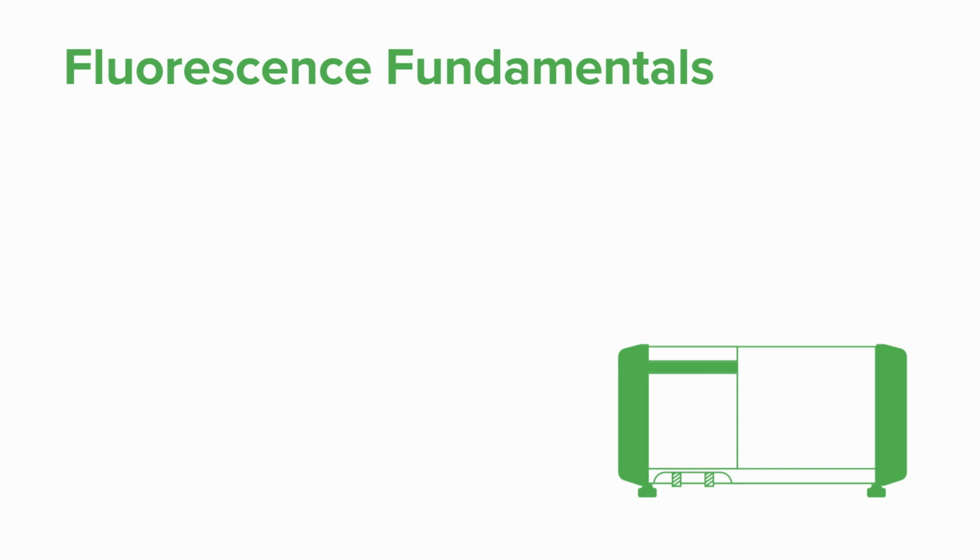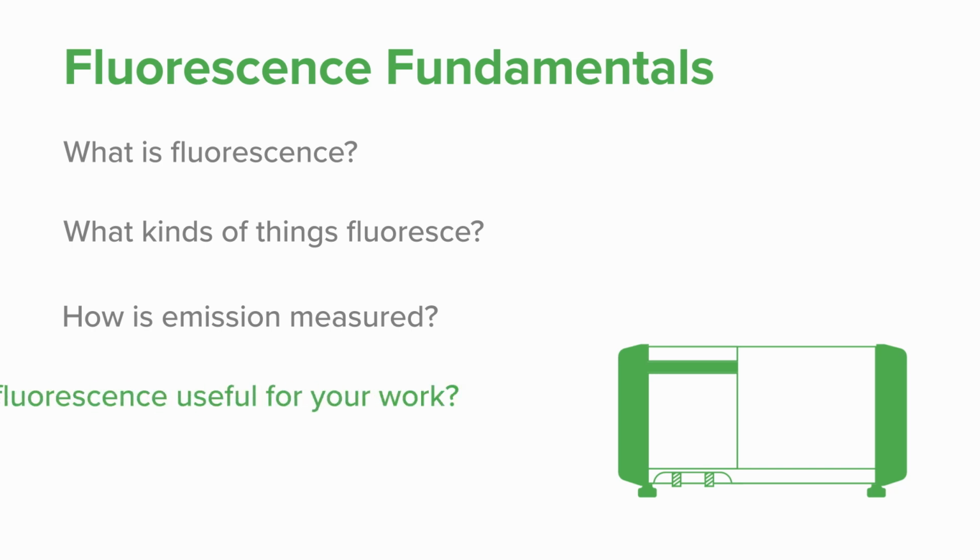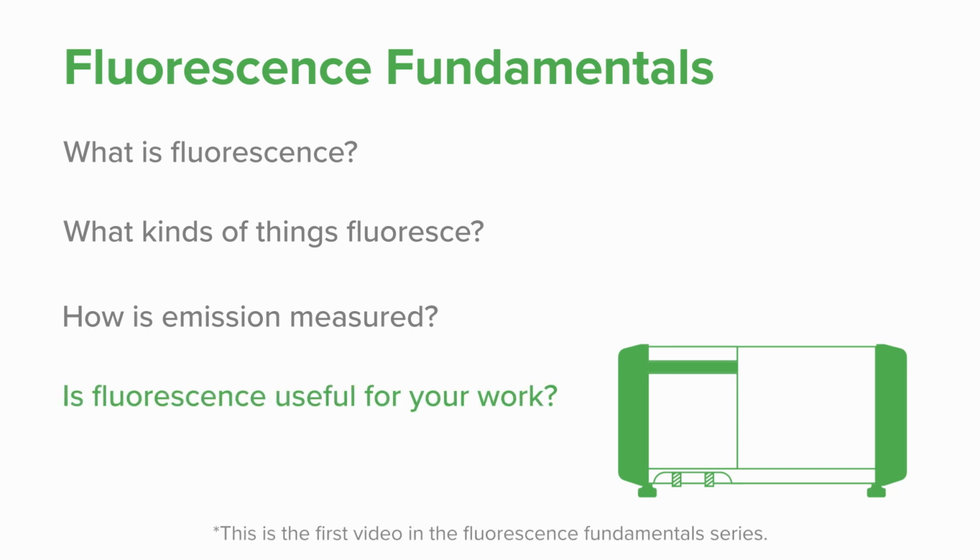So let's take a closer look together over the next few minutes. We'll review what luminescence, or in particular fluorescence, is, what kinds of things fluoresce or emit, how emission is measured, and hopefully give you some ideas of whether this is useful for your work.